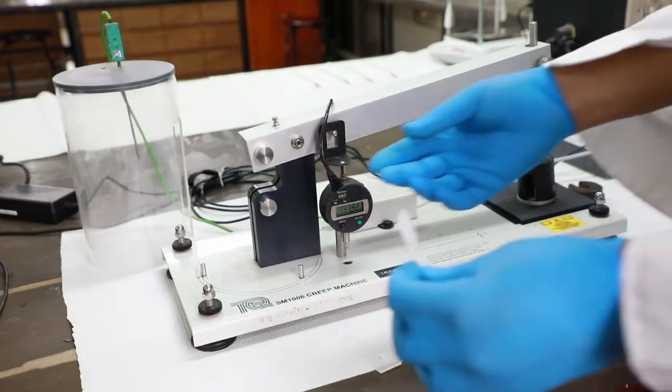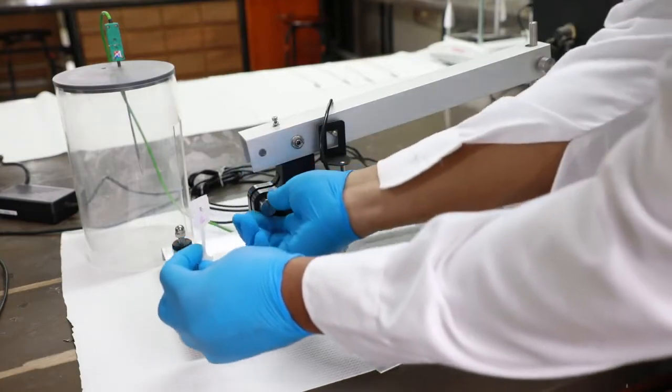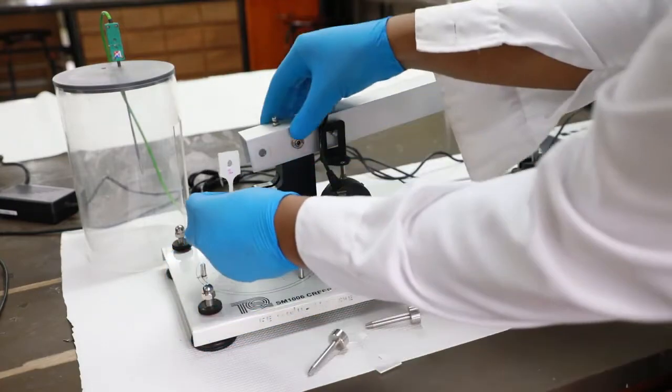Place sample number two vertically into the creep apparatus and secure with two pins whilst holding the lever arm.